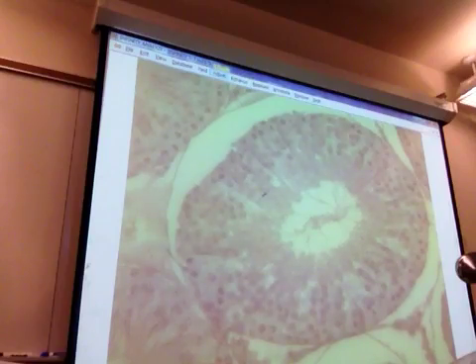I'm not going to ask you to tell me the difference between primary and secondary, but you should know the difference between a primary and what these guys are. Spermatids, yeah. So you should know the difference between them. Should we know the difference between a spermatogonium and a primary? Yes, you should also know that. Could you show a couple more examples of the two different kinds? So here's a spermatogonium. Here's a primary.